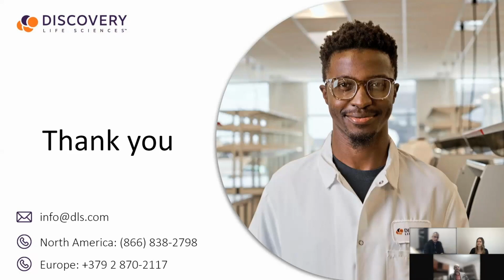Even before, I think Covaris has a very commercial product out there to utilize that. So we do see a lower failure rate, ease of utilization, and integration with automation. I understand that might not be possible for smaller labs, but I would highly encourage you to explore those opportunities within your university systems, core labs, or talk to us, or some people who can provide that opportunity, because ultimately the clinical data is very important.